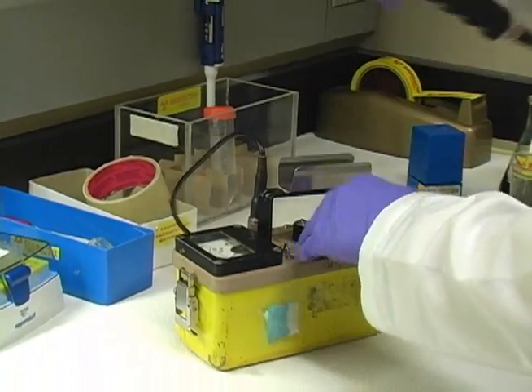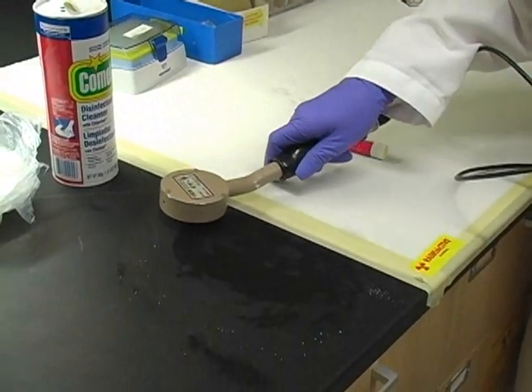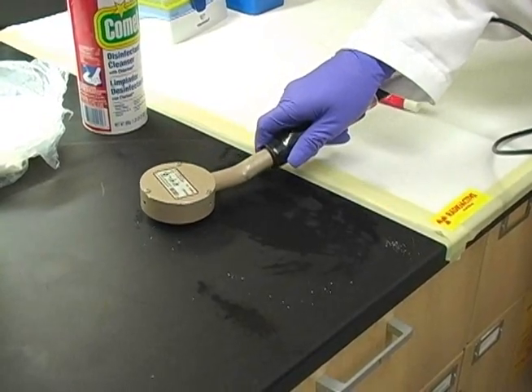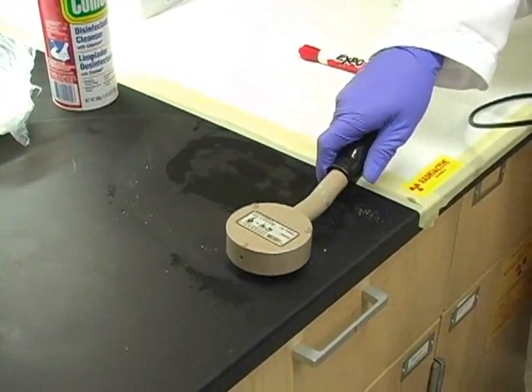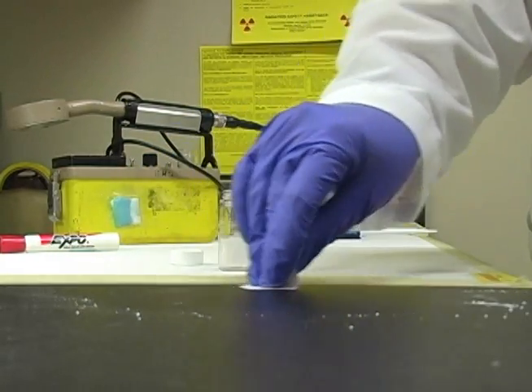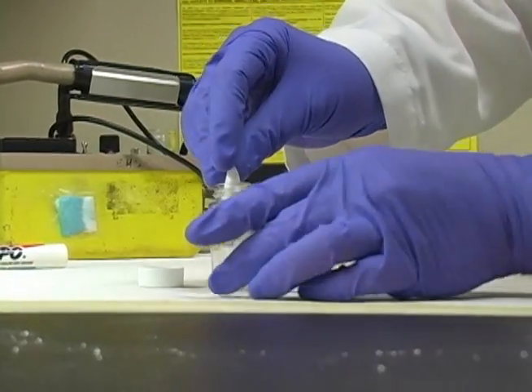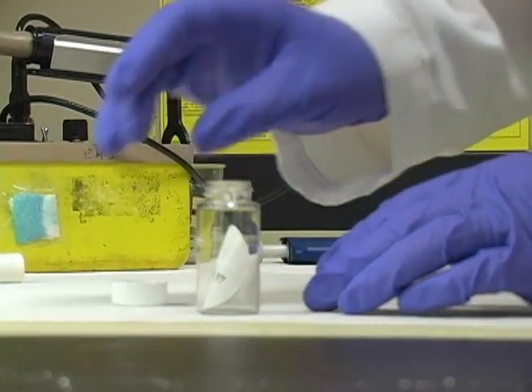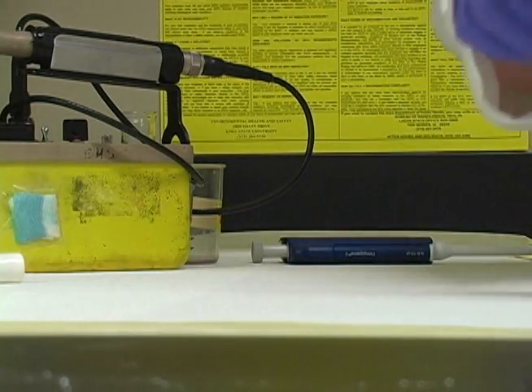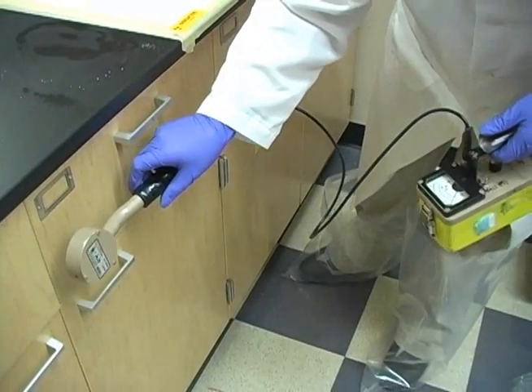Once we think we've got it all cleaned, we can check with the meter. It may read nothing or background, or there may be a hot spot still there. We'll take a wipe and confirm nothing is coming up by counting it in the liquid scintillation counter. Occasionally there'll be fixed contamination in a crack that won't come up — just let EH&S know the results and we can deal with it.